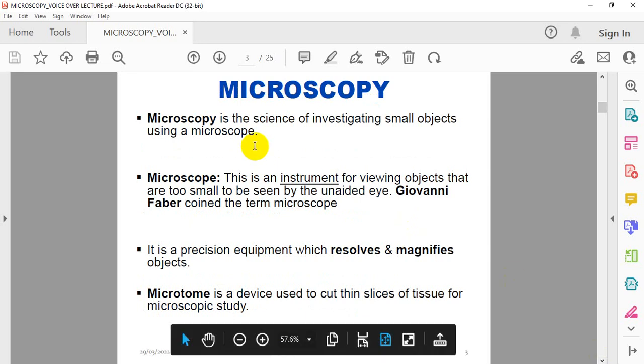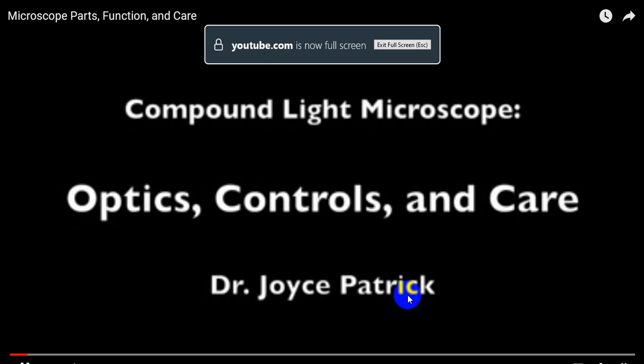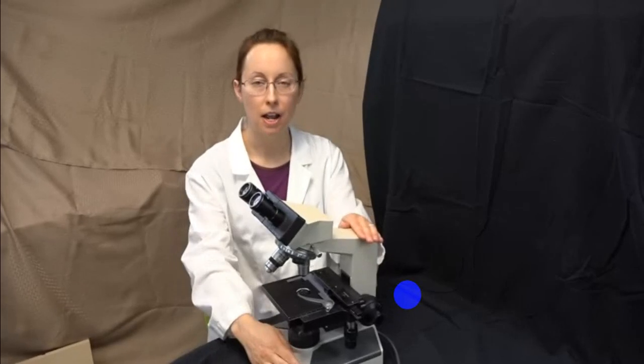What is a microscope, or what is microscopy? Before we zero in on the functions of the microscope or what microscopy is, we would like to watch a short video demonstrating the parts and operations of a compound light microscope.